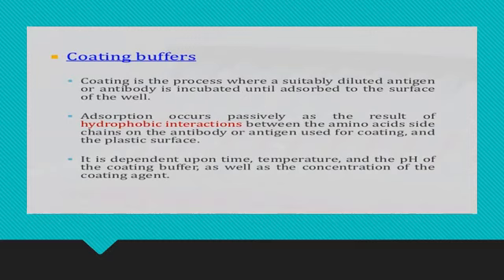فدائما احنا نشتغل experiment لازم نسوي trouble shooting، يعني نعرف احنا وين الخلل. ليش مثلا احنا نعرف هذا الانتيجين will bind very good with the antibody but بالاكسبيرمنت من جينا اشتغلناها ما صار development للcolor. فشنو الخلل؟ ممكن انه الانتيجين التركيز الانتيجين اللي سويت له كوتنج على البليت قد يكون قليل. فكل اكسبيرمنت تحتاج الى شلون trouble shooting حتى تمشي الاكسبيرمنت مالتنا صحيحة.